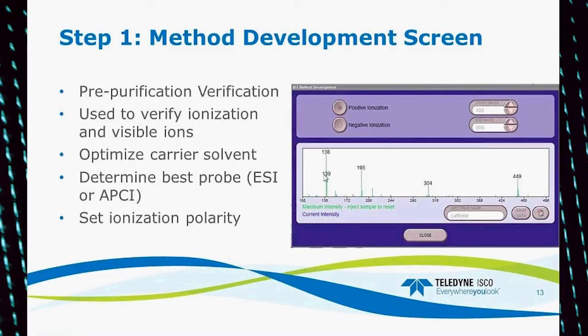Since this is a flowing system, the sample is flushed into the mass spec. It maximizes the mass values, and then that is pushed on out of the mass spec, and it continues to monitor the baseline. So as soon as it reaches the maximum signal value for any mass, it locks that into the green line. And because that mass signal was so strong in this example, the current intensity, which is just baseline, doesn't show up; it would be a flat line down here at the bottom of the screen.